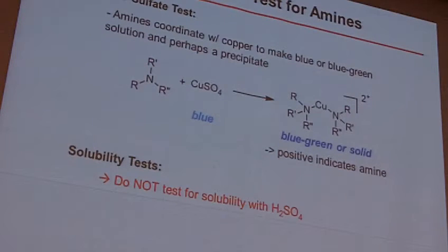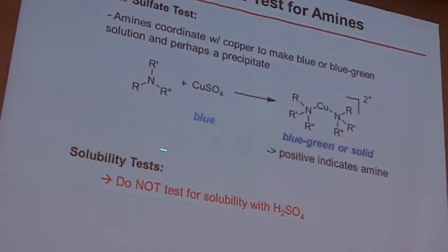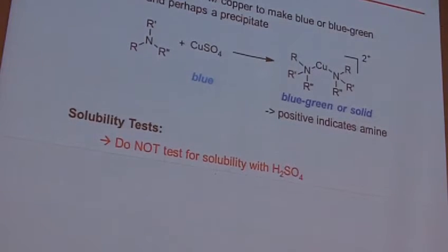So that's really about the only chemical characterization test we have for nitrogen. If you find yourself with a nitrogen there, it's a relatively short path. You're going to have to really rely on spectroscopy and things like that. Beyond that copper sulfate test for nitrogen-containing compounds, you'll also want to do the solubility test. These are the same tests that we did back in experiment 6 last semester. So you know how to do those.